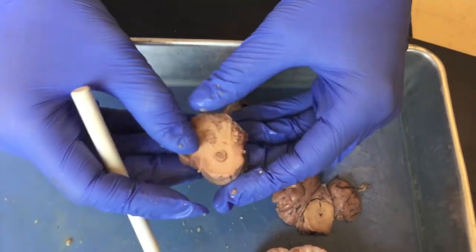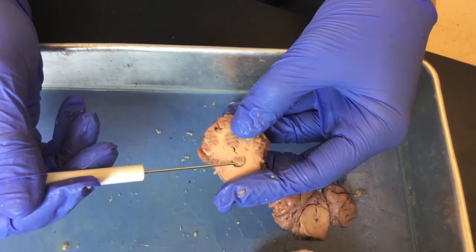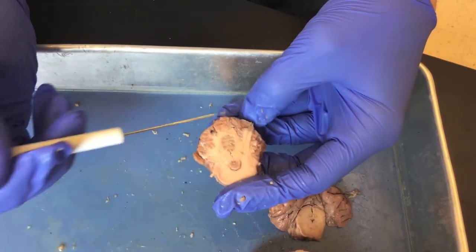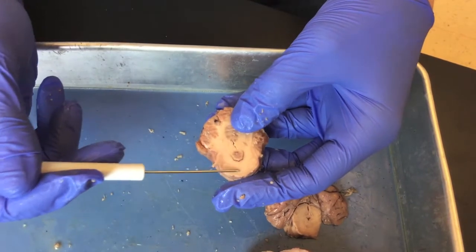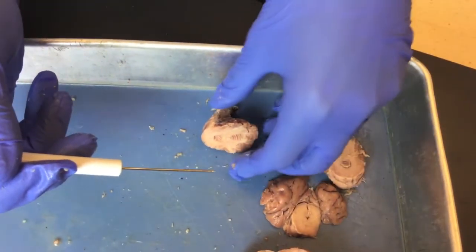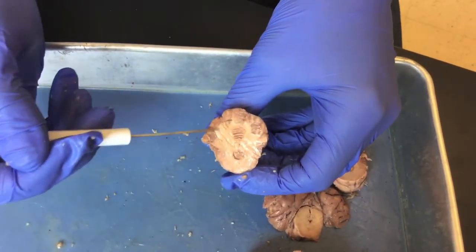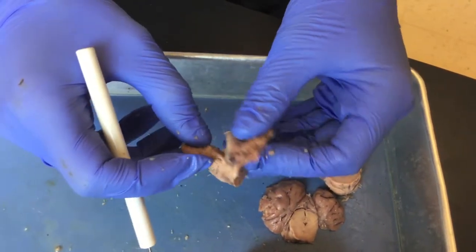Moving posteriorly, the cerebral aqueduct then empties into the fourth ventricle. Here's the cerebellum above, and here is the pons below. The fourth ventricle continues underneath the cerebellum and then into the medulla oblongata.